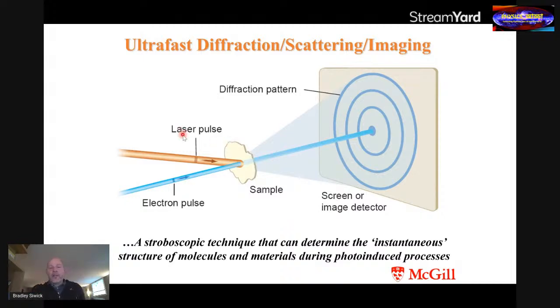So you, in general, use the laser pulse to drive the electrons out of equilibrium. You excite specific photochemical transformation in the sample, okay? But laser pulses can also be used to directly modulate interatomic distances through direct coupling to vibrations, okay? So laser pulses can be used to either excite electrons in the sample or directly drive vibrations in the sample and probe different kinds of processes that might be happening in materials, okay?